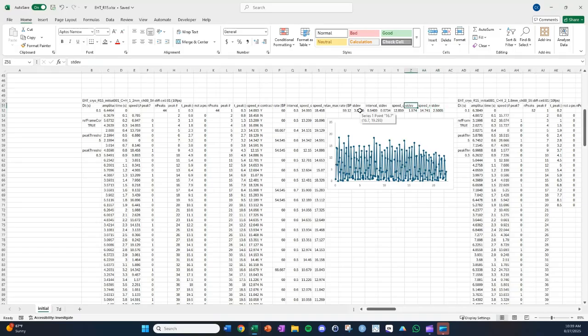all the other ones. So what you can see here, which is pretty typical for what I'm doing, is we got a speed around 10 initially, and a time between peaks of about 0.5 initially. This beats per minute is actually rather high from what I've seen, but definitely reasonable. So let's try to go on to something that might be harder to analyze.